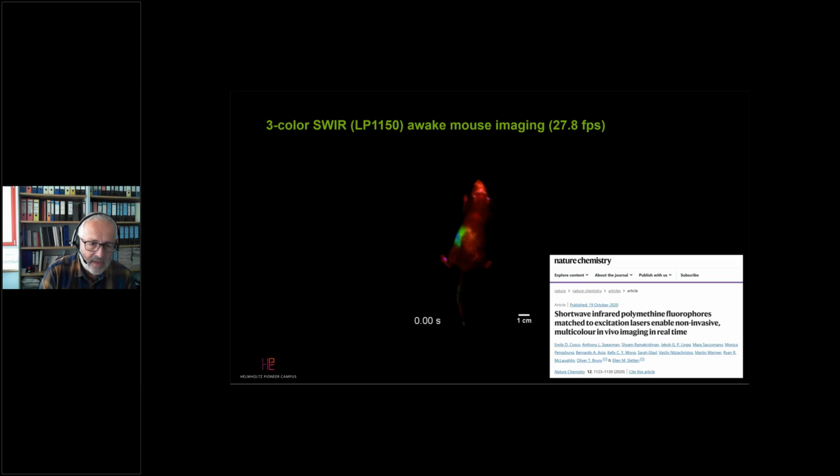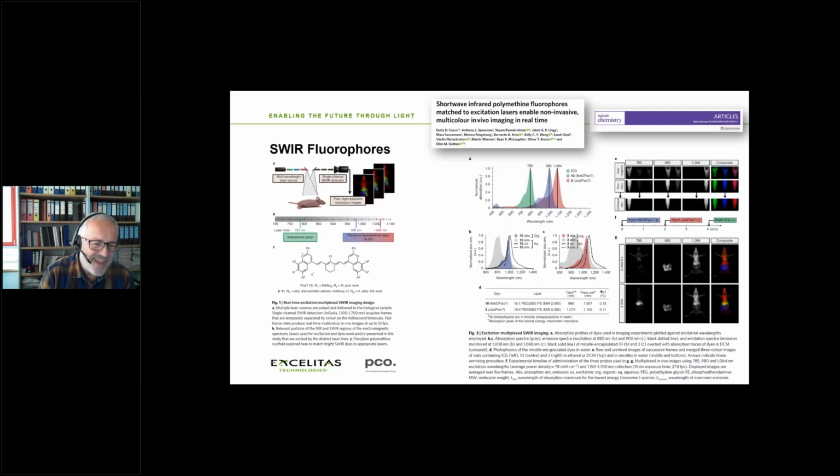And even better than that, this is one paper dealing with different fluorophores, because currently there's a lot of research and investigation ongoing. All the nice features of SWIR don't help you if you don't have proper stains. On the other hand, there are already some stains that exist, like ICG or IRDye 800, and they can be modified to couple to and stain different molecules for different investigations.